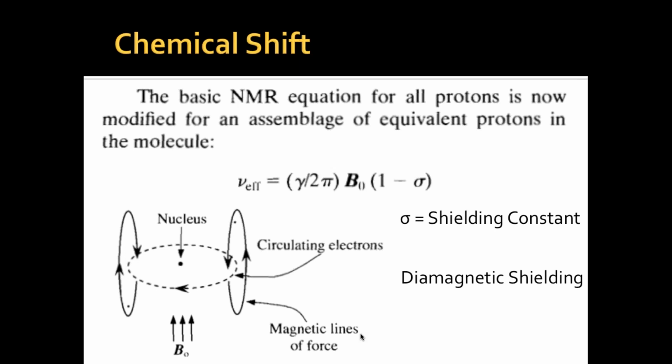The most common term for the NMR people to use is chemical shift. Chemical shift means where your molecule's hydrogen or carbon is showing up in the NMR. So you can calculate that frequency via this equation. Now, of course, we can always follow this equation to calculate the frequency, but we don't have to. I will explain to you later how to remember the values. That is quick and easy to know.